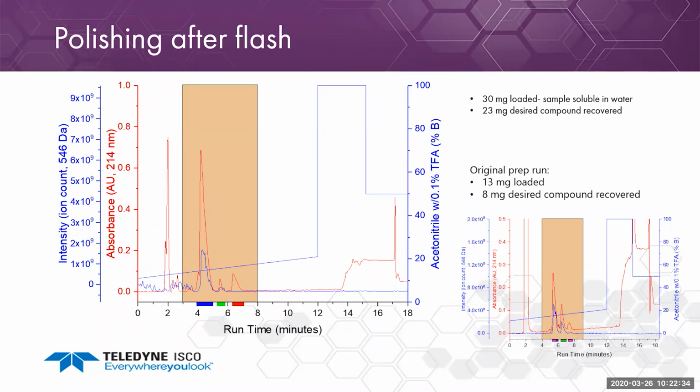All I did was evaporate the organic solvent from my flash fractions, and so I didn't need to use DMSO. The impurities are very low, and that was almost ready to use for whatever other purposes that you need. Down over here, we see the prep HPLC run.